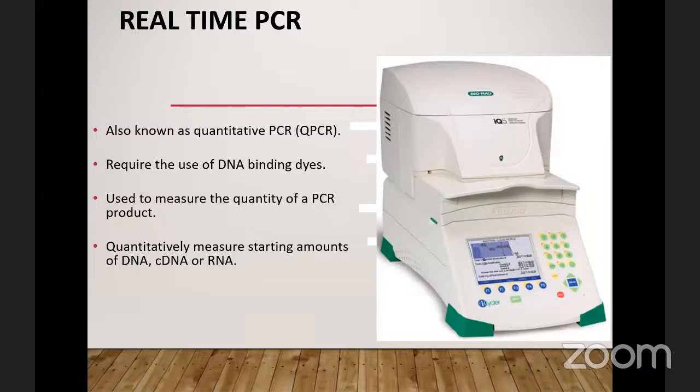But if I'm doing a WhatsApp message to you and you are online, and I'm online and I'm typing a message, you are going to see that I'm typing a message before I send the message. And once I send the message, you receive it instantly, right? So that's how I would explain or differentiate between real-time PCR and conventional PCR. So real-time PCR is the type of PCR where you can see the PCR product in real time as it is happening. You are seeing whatever is happening inside the setup.